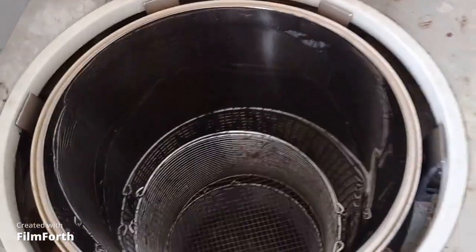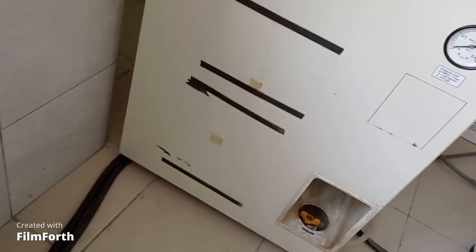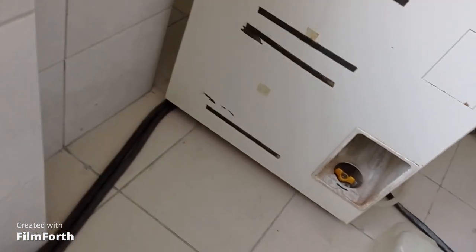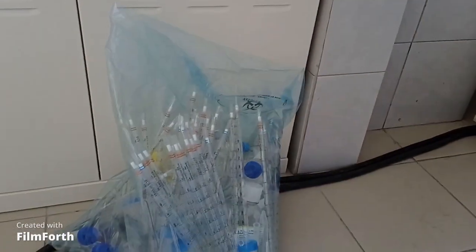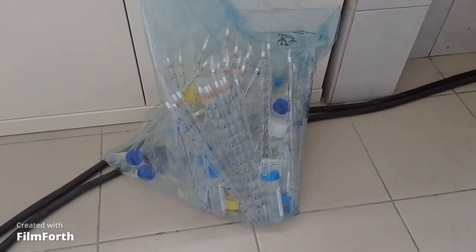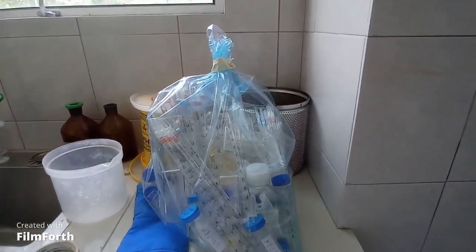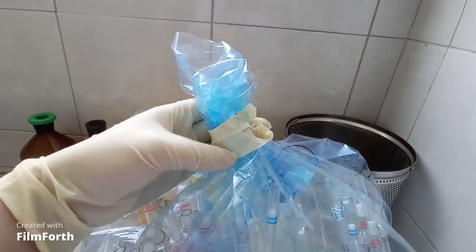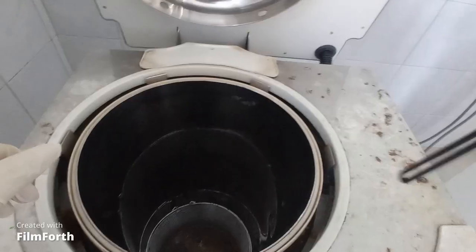Here you can see I have the clinical waste in a blue plastic bag. First of all, I need to bind this plastic with an autoclave tape. I have already bound the plastic and secured it with an autoclave tape.